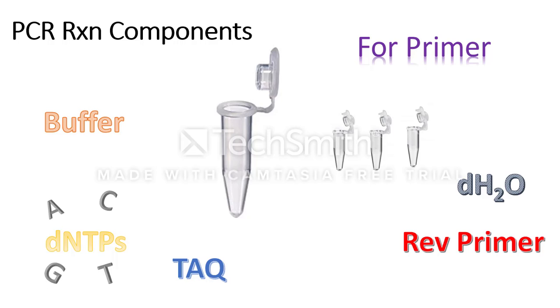Before looking at the process of qPCR, let's recall the process and components of regular PCR, as qPCR builds off this common technique. PCR is a technique used to amplify a specific gene or portion of DNA. PCR utilizes a series of reagents and a cycling machine to increase the number of copies of your desired gene.